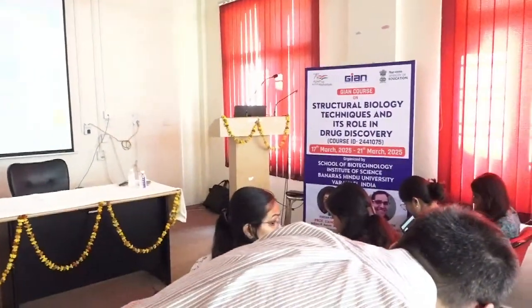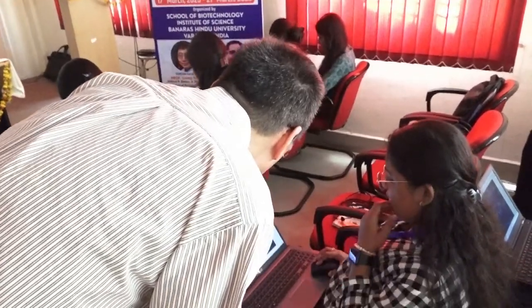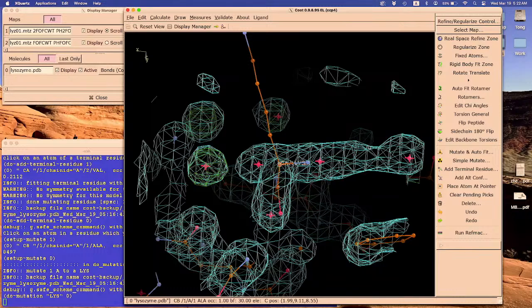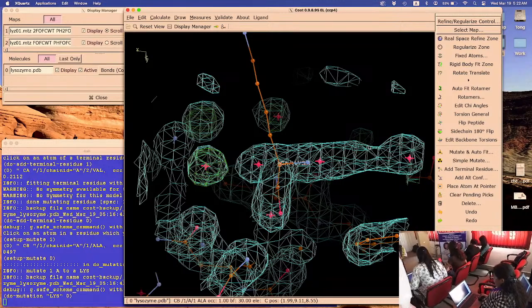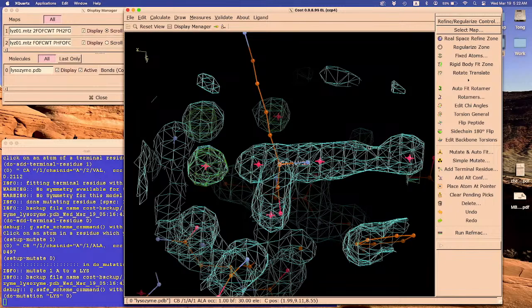Add terminal residue and shift. But so go here. Here. And then Chain. Open this, yeah, and then click on 2. 2. There you go. Say accept. Apply. Yeah, you're there. Okay. Add terminal residue. That's right.